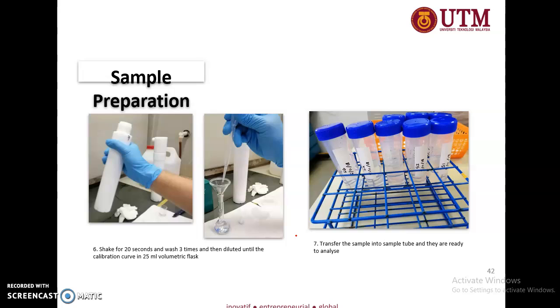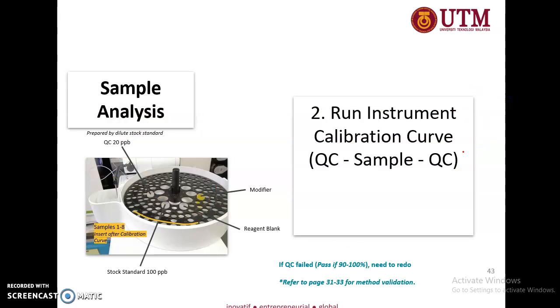After that, prepare and transfer the sample inside this Eppendorf tube, and then it will be subjected to the graphite furnace. In the previous video, you watched the chemist say that we have an autosampler. The autosampler is very good to use because it can speed up the analysis in routine monitoring.